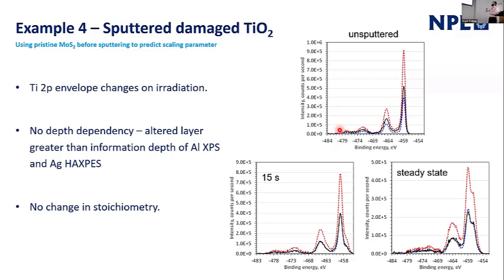So when you apply the algorithm, you don't see much difference between the surface-free depth distribution and the two raw spectra. In that case, there's no change in stoichiometry and no benefit to using it. So certain materials may not work. That's just cruel reality, unfortunately.